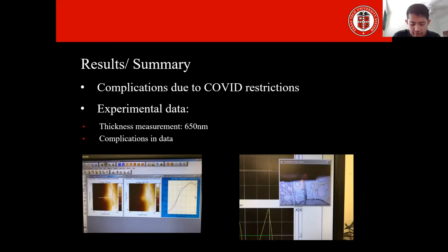From previous research by O'Connell and Dr. McKenna, testing results from the method have shown that the glass transition temperature, the Tg, of polyvinyl acetate is virtually unchanged down to a film thickness of 27.5 nanometers, while for polystyrene, the Tg is reduced by 40 Kelvin for 13 nanometer thickness films. I will continue to further my research regarding how the PIB would react to the nanobubble inflation technique.